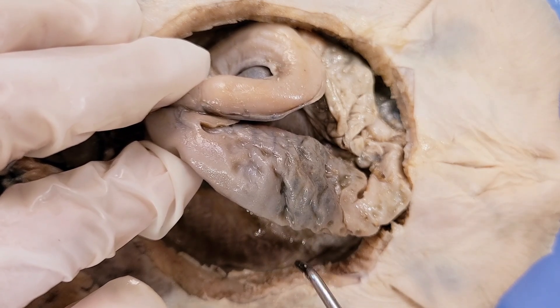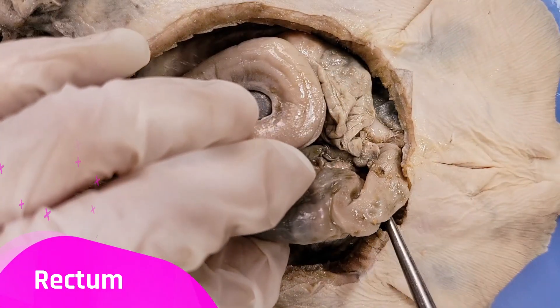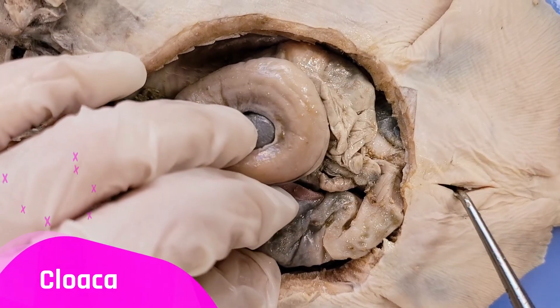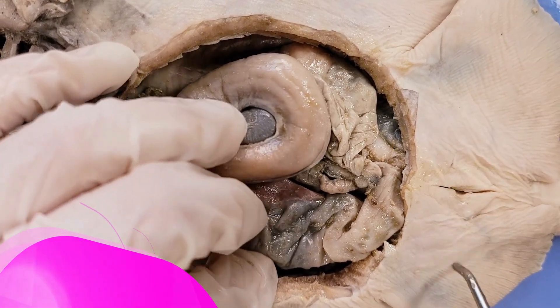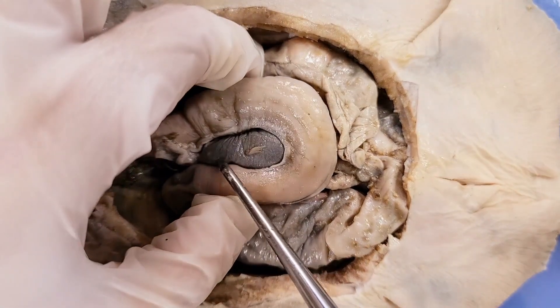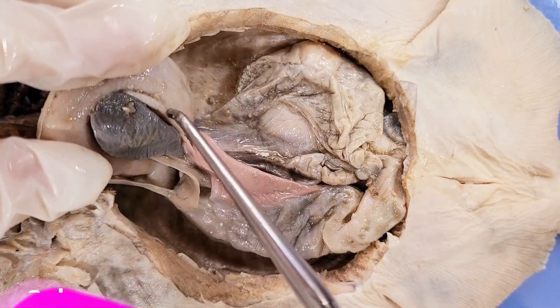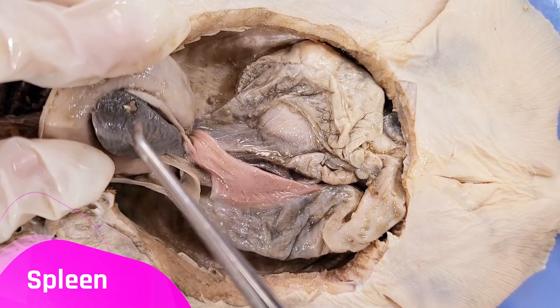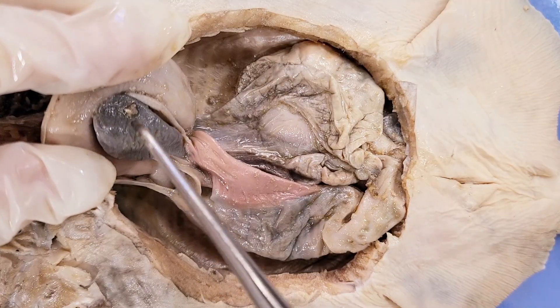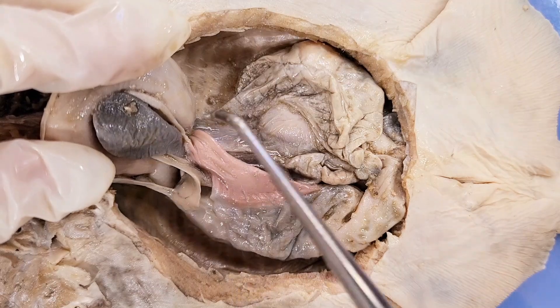We might cut this open later to get a better look at the spiral. The intestine leads into the rectum, which is where the waste is stored, and the cloaca, where the waste is expelled. Now this triangular dark structure that lies against the stomach right here is the spleen. It's not part of the digestive system; however, it is the main part of the skate's immune system. The spleen also plays a role in breaking down old blood cells.